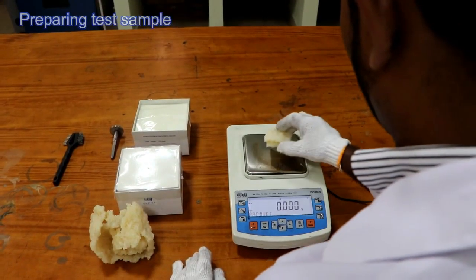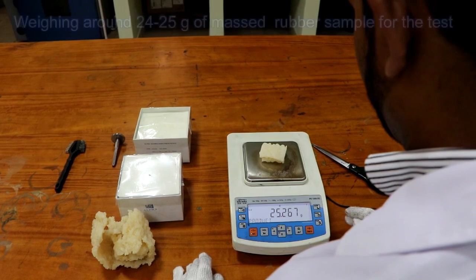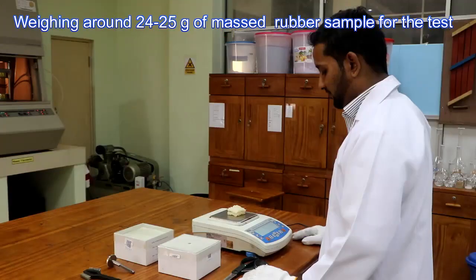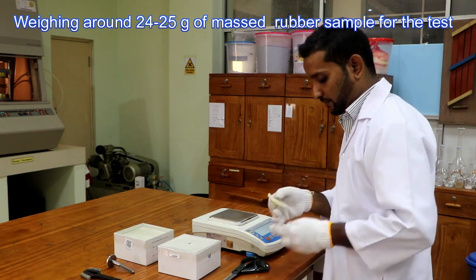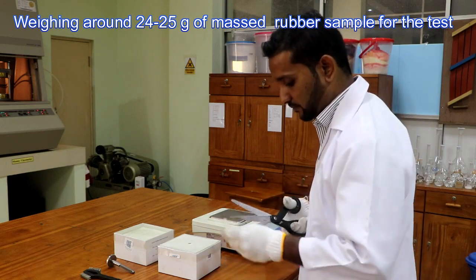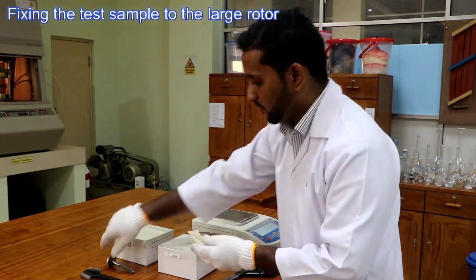Okay, then how to prepare the test sample? Okay, we have to weigh around 24 to 25 grams of massed rubber sample for the test. So this is how we fix our rubber sample to the rotor.